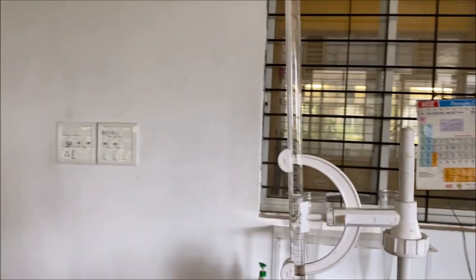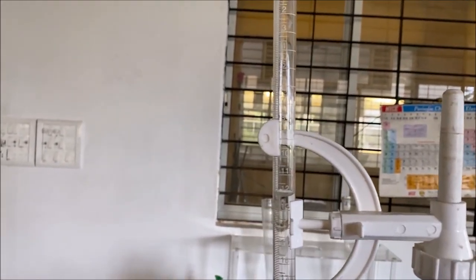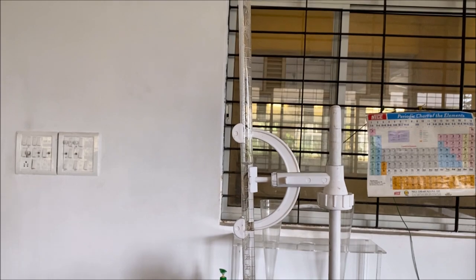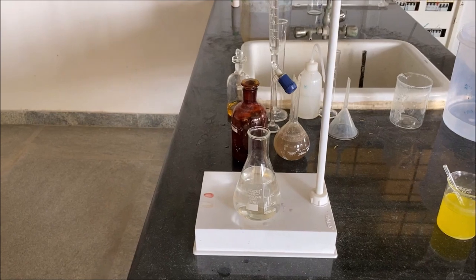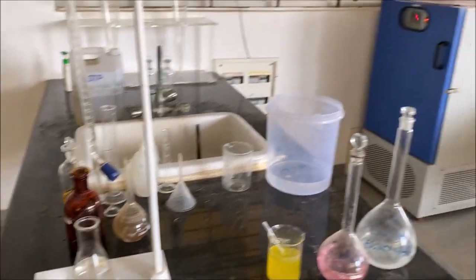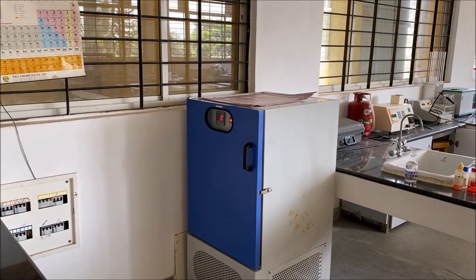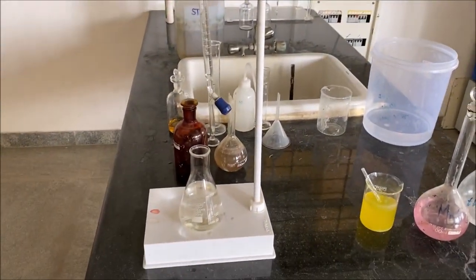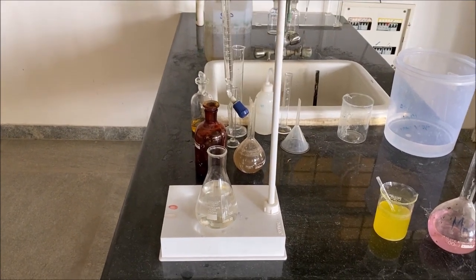At this point of time, we have to note down the reading of the volume of standard sodium thiosulfate solution spent for titration. This reading is utilized for the calculation of DO for the BOD bottle containing 30 ml of sewage sample. At a later stage, after 5 days, we are going to remove the 2 BOD bottles containing dilution water and titrate again to determine DO, so that we complete the BOD experiment for the determination of BOD in the given sample.